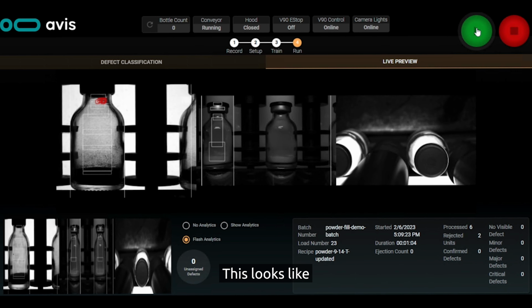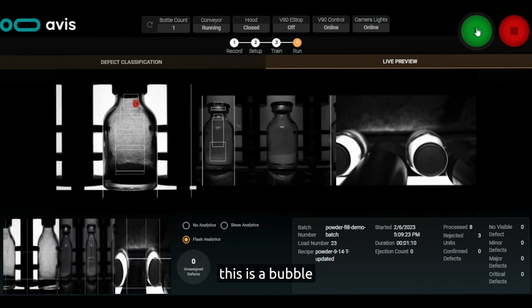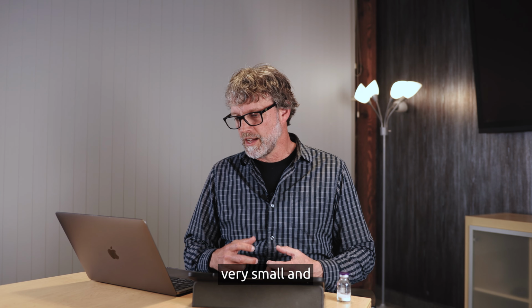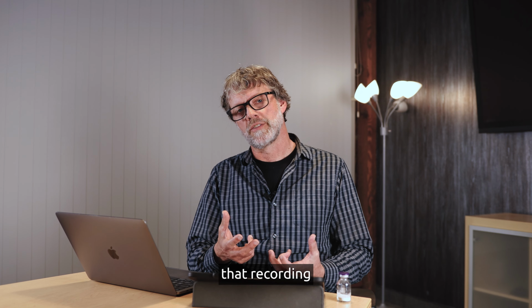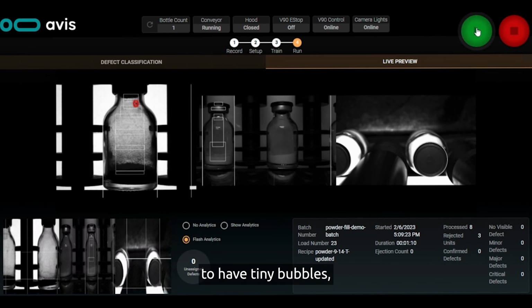Here's another defect. This looks like some kind of a scuff up along the neck of the vial. Here's another defect, which is a bubble in the glass. It's very common for molded glass to have bubbles, especially in the neck and the shoulder area, although typically they're very, very small. And one of the things that Avis does, since it's an unsupervised machine learning system, is when it's processing that recording of the compliant vials, it's learning that in the neck and shoulder area, it's okay or it's compliant to have tiny bubbles embedded in the glass.